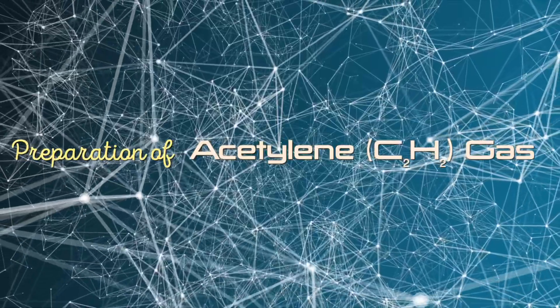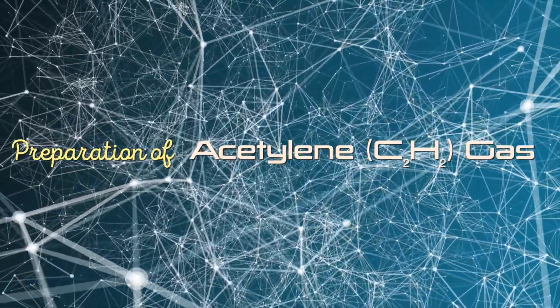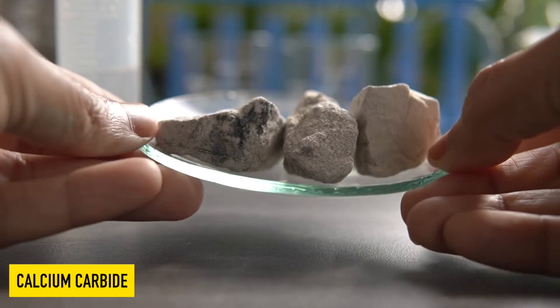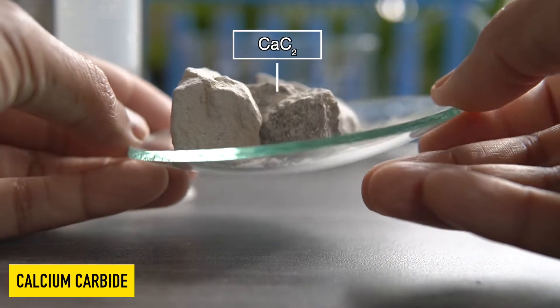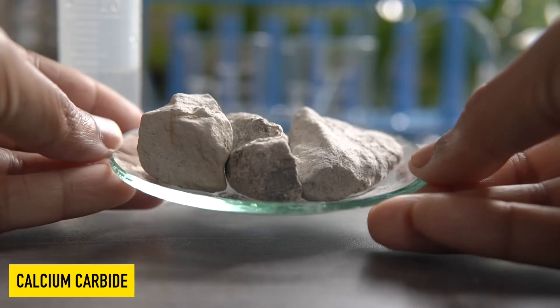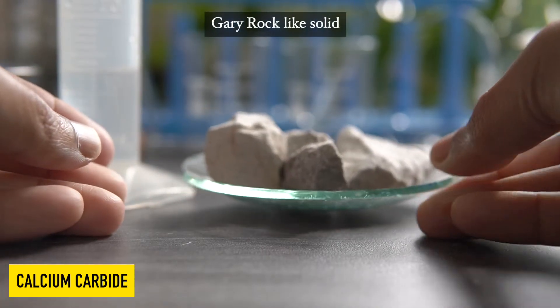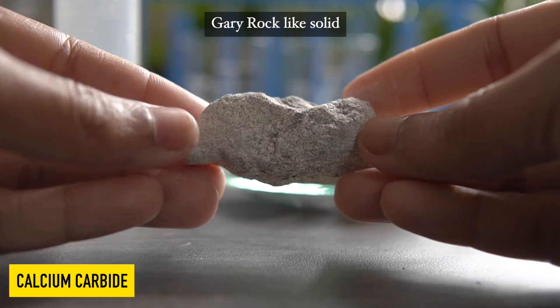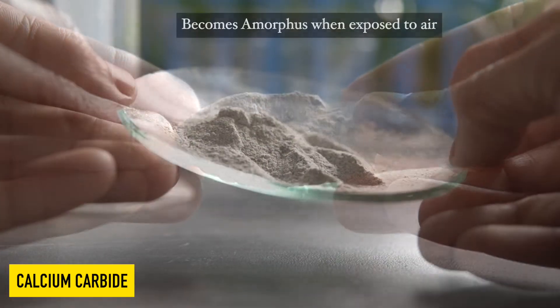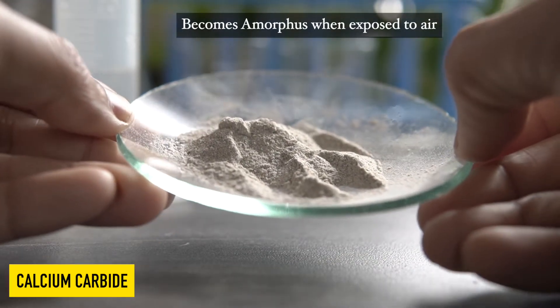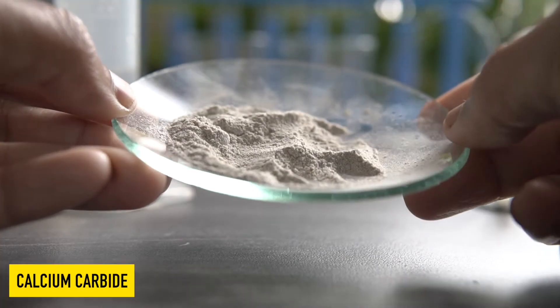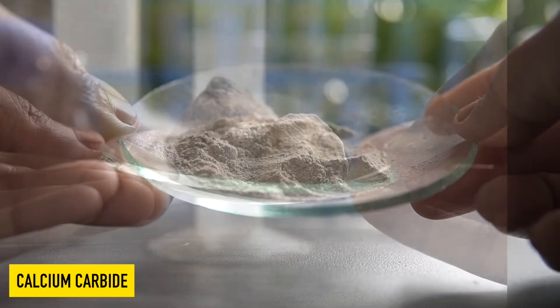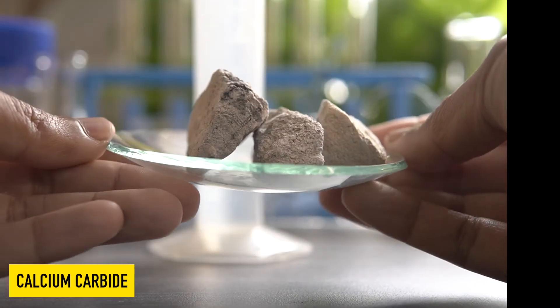Today we will see how to prepare acetylene gas in laboratory. To prepare acetylene gas in laboratory we need calcium carbide. Calcium carbide is a gray color solid. It can easily be available in your hardware shop. It is a hygroscopic substance and can easily become amorphous if exposed to air. That is the reason why we should always keep calcium carbide in an airtight container.